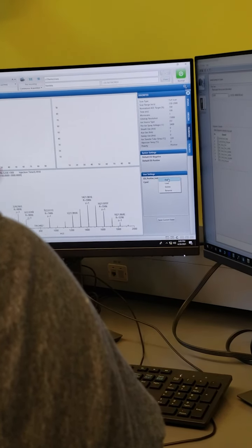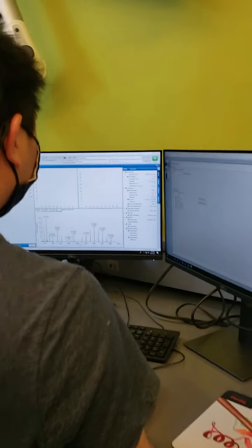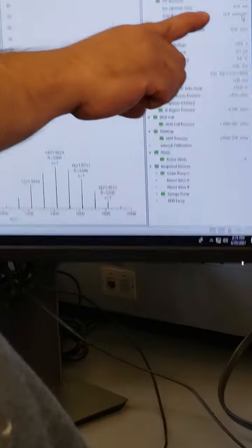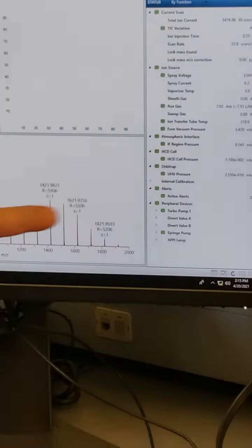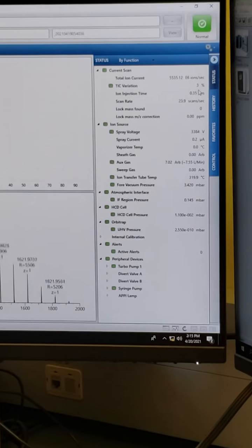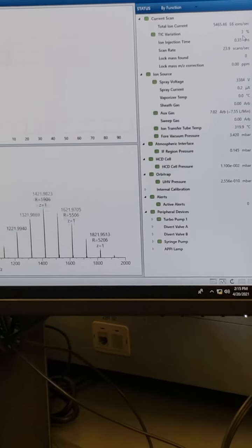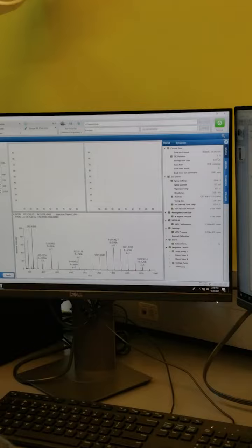We have what we call a state or settings. We're going total ion current count over time. Okay? It's basically saying we have a 2%, 3% variability in the spray. That's really, really good. So when you're on the pro level, you just look at that. Or you could pretend you know what you're talking about and everybody else is like, what? Wow, you're amazing.